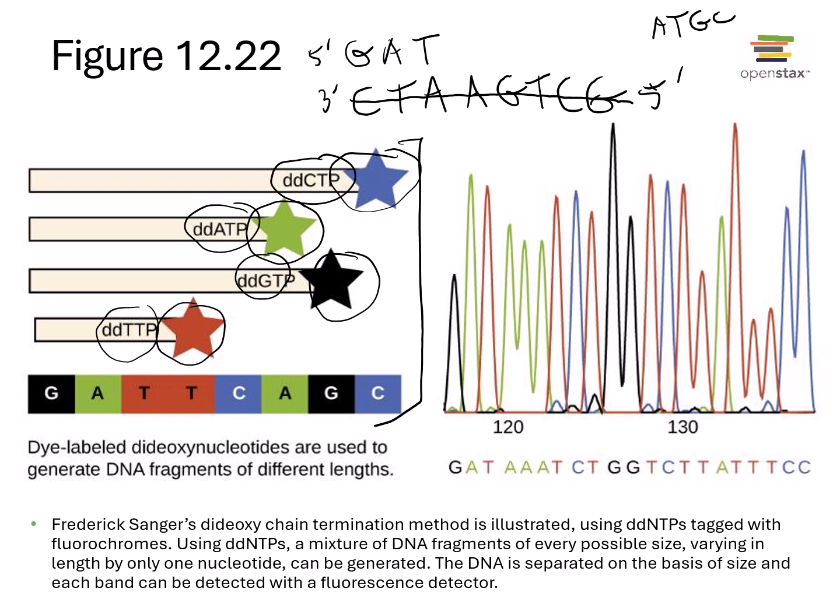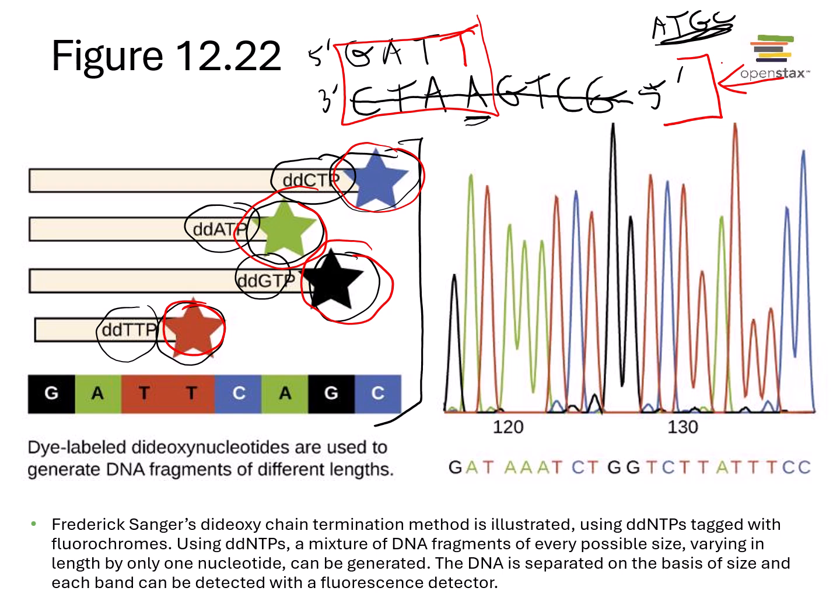So here, let's say I read A, instead of putting down a regular nucleotide, I incorporate a dideoxynucleotide, so the one here. That means I can no longer grow, there's no 3' end, so my chain will terminate here and I'll generate a short fragment. Imagine this is happening thousands of times in the machine, and every once in a while, they're going to randomly incorporate one of these other dideoxynucleotides.